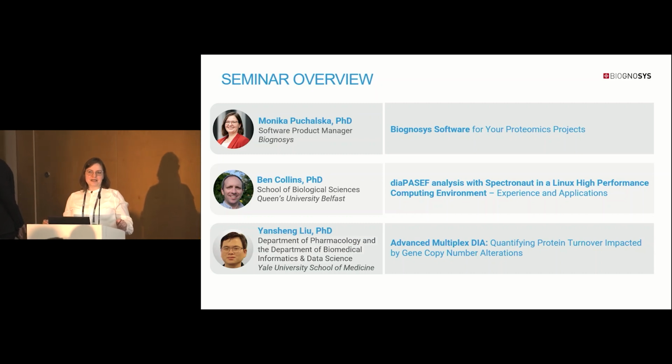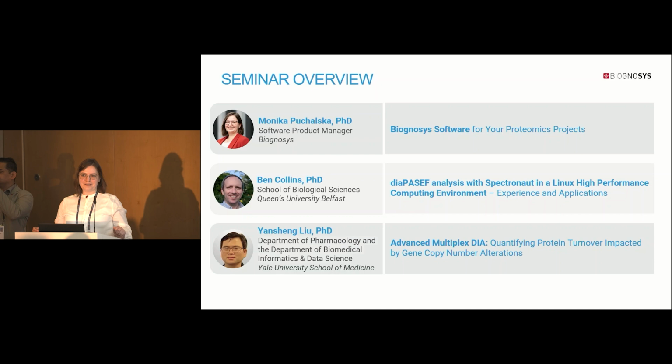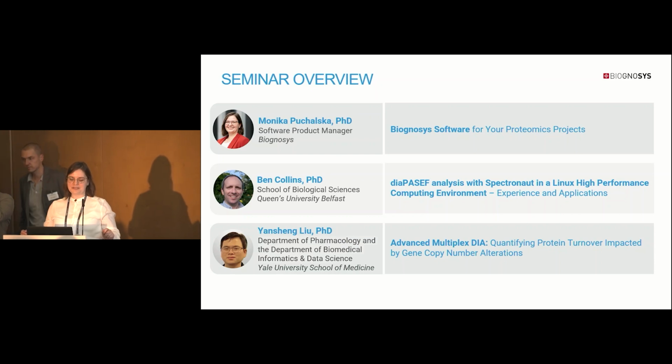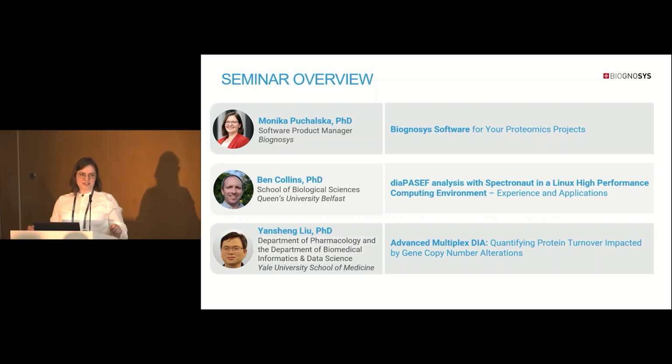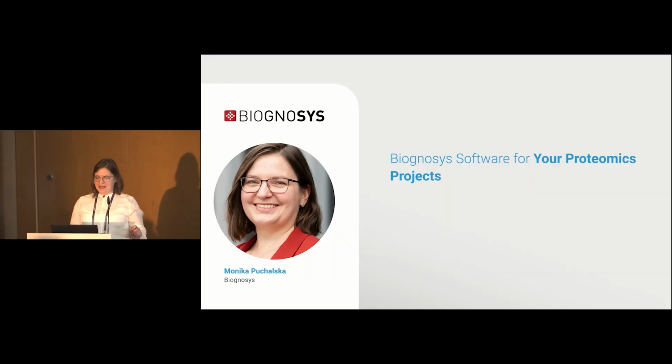And afterwards, we will have another guest speaker, Yansheng Liu from Yale University School of Medicine, talking about advanced multiplexed DIA and using it for quantification of the protein turnover impacted by gene copy number alterations. So let's start with the short introduction.